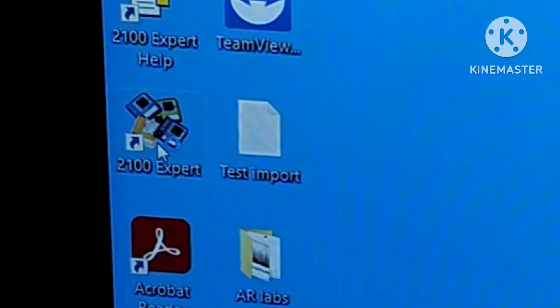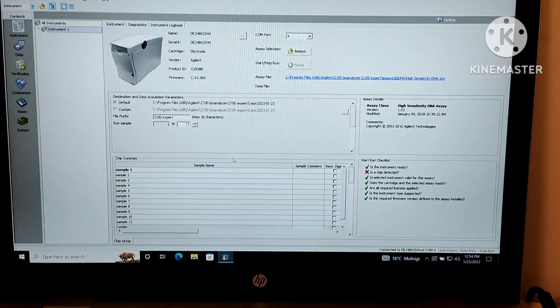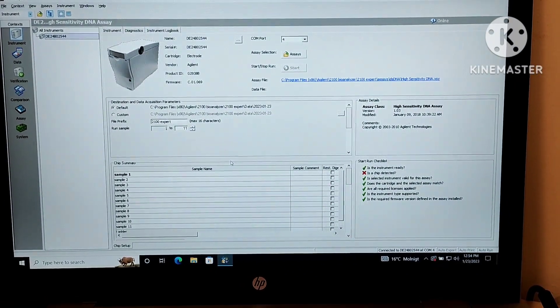Hello everyone, today I will tell you how to run samples in a bioanalyzer. For that, I will turn on the program. Here you can see the program is opening—it will take some time. Here is the loading screen for that.